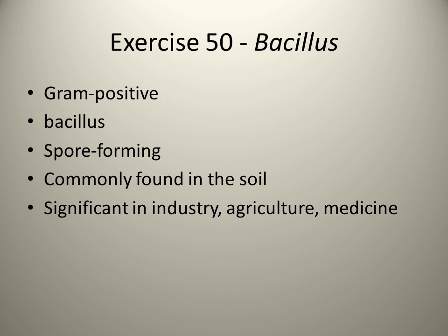Number one, do a gram stain. If you see it's gram positive and it is rod shaped, you can do a spore stain to see if there are endospores. Then you want to continue doing additional tests such as a catalase test. You could do the starch test, the motility test. All of these biochemical tests would help you with the identification: is this in fact Bacillus or not.